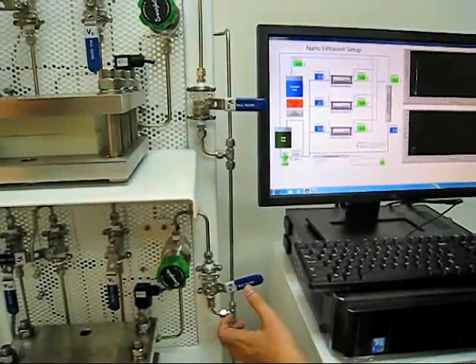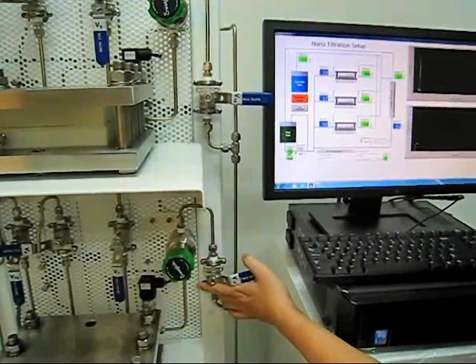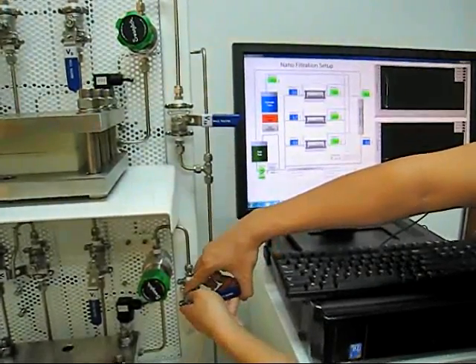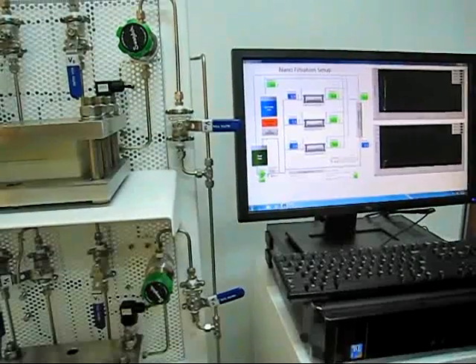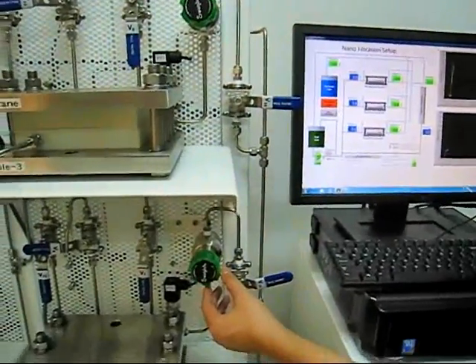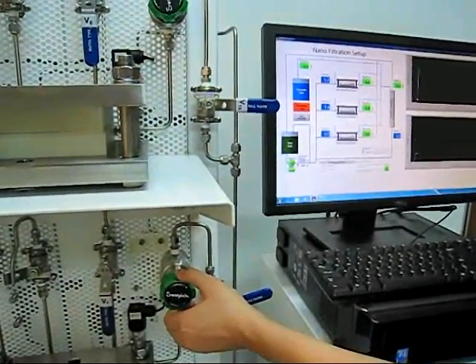8.4, 8.6, 8.9. Slowly — 8.94. At this stage you can either increase it slightly further. Okay, it will come down. We're at 9.4 now and we're going to use the back pressure to fine-tune the last 0.6 bar. The flow across the membrane is 3.6 liters per minute.